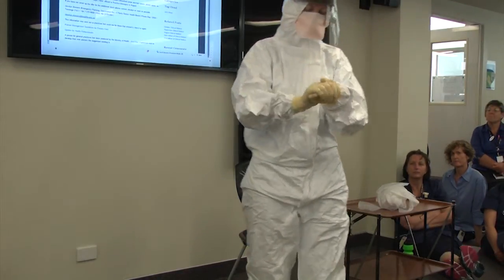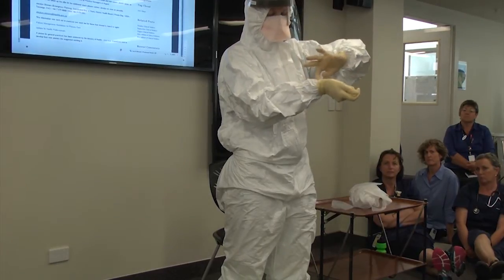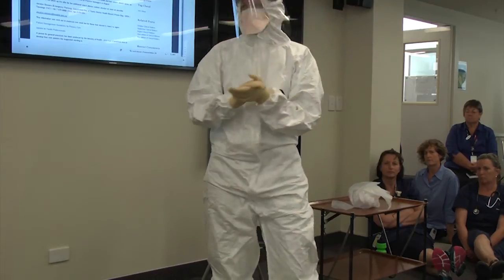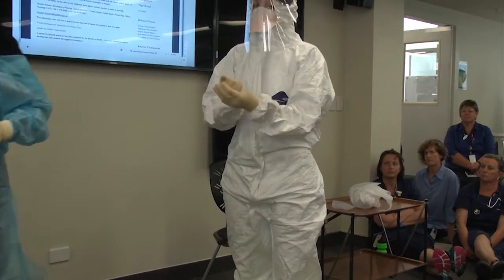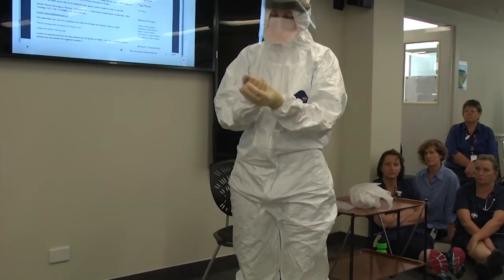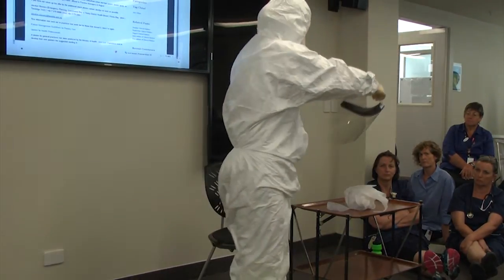Kate, I'd like you now to remove your outer gloves, rolling them inside out. Now we will remove your facial gear. Take your face shield — I'd like you to bend slightly forward. Take your face shield by the back, pull it up and over and away from you, and discard your face shield.